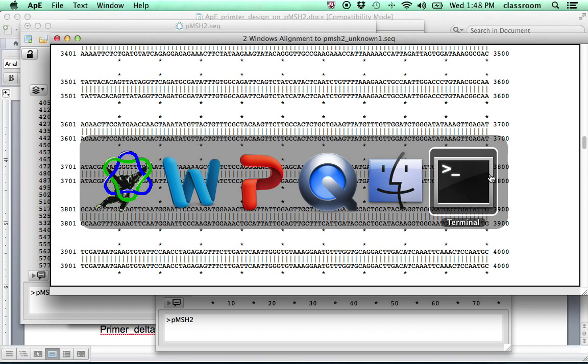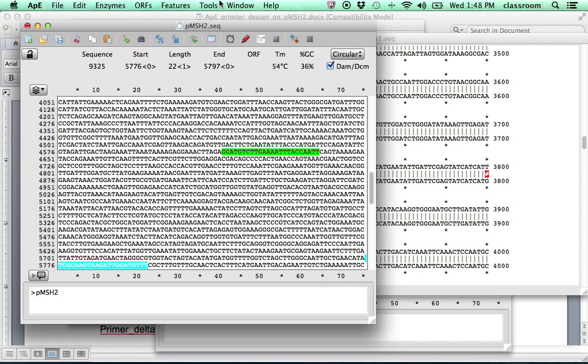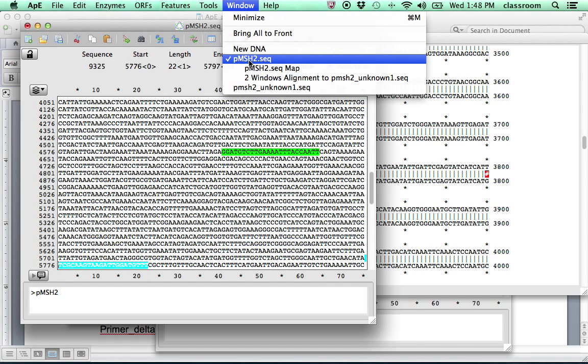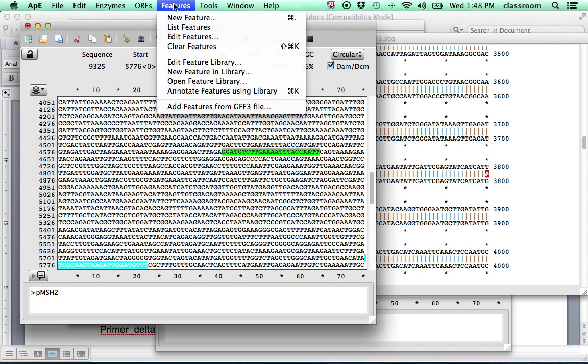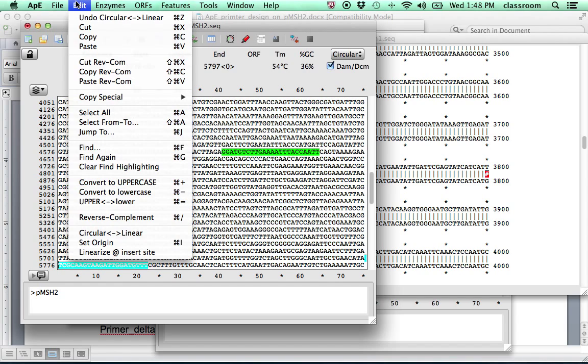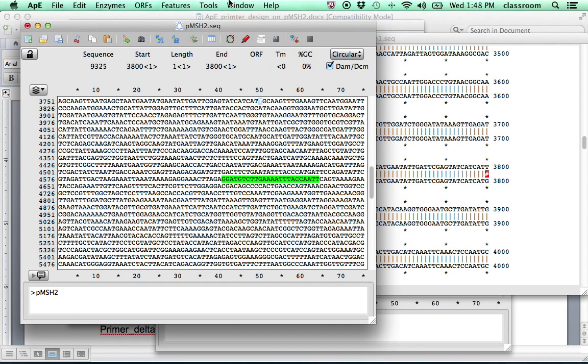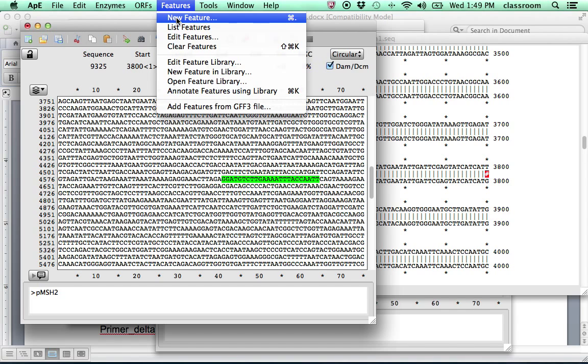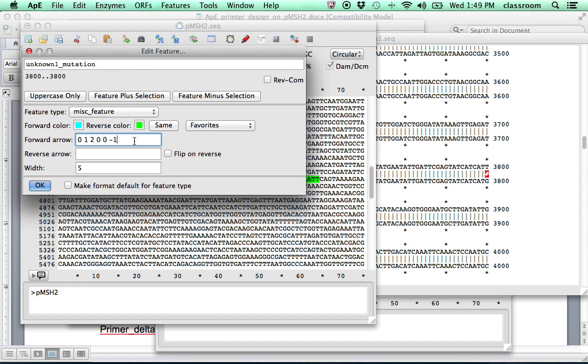So let's go. We just need to label this mutation on the map. Make sure you go to the pMSH2 plasmid sequences. And then we're going to find the mutation. Find. Well, select from. We know this is 3800 to 3800. So that's the feature. New feature. And we know this is the unknown P unknown 1 mutation. This time, I don't want to put an arrow there. So I'm going to remove the arrow. I also want to make sure this one is going to pop up. So I'm going to put 15 there.